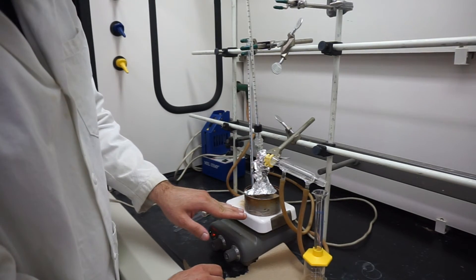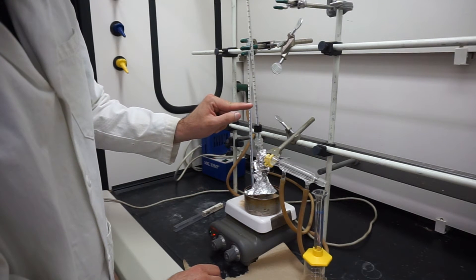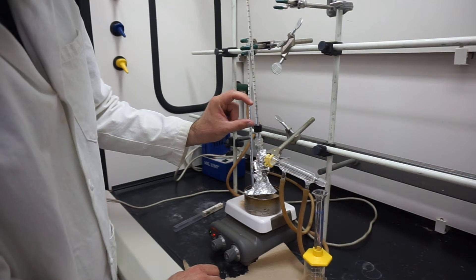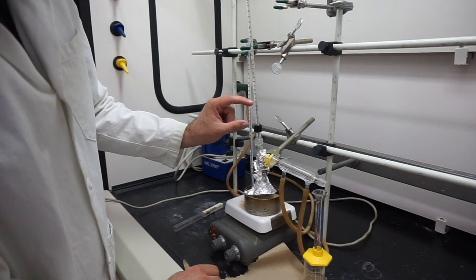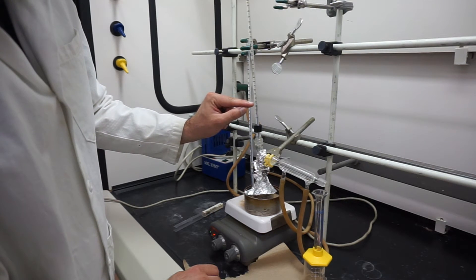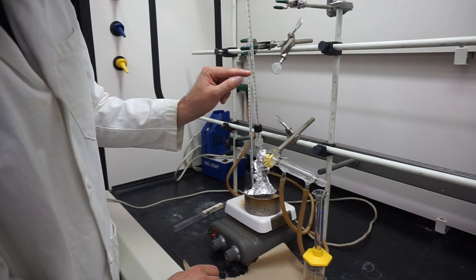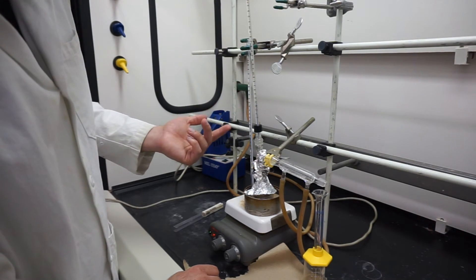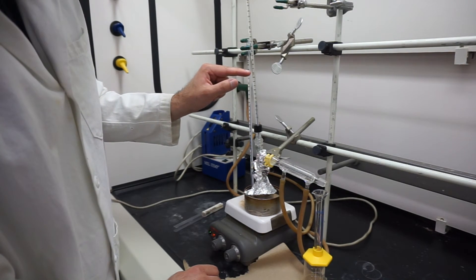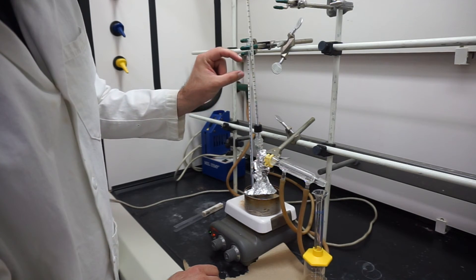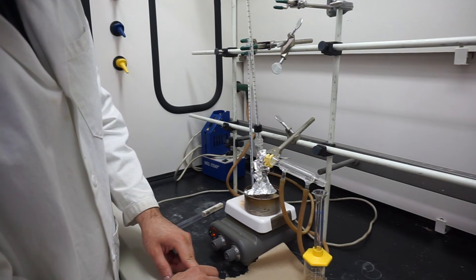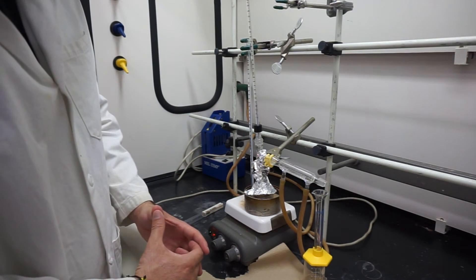As your distillation progresses, what's going to happen is the temperature in your thermometer up here is going to increase. As you actually distill out, it should reach closer and closer to the boiling point of your solvent. For water, we might see it get kind of close to 100, but it might actually take a while to heat up that long. That is the setup for your distillation.